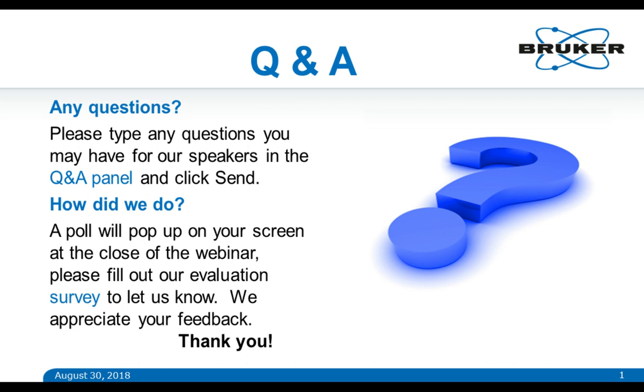So I start questions for the lady first. Elaine, I have a question now. What is the balance between untargeted and targeted analysis in your laboratory? So when we started out, it was 100% untargeted analysis, and personally as a scientist I would always prefer untargeted analysis to start with, because it allows you to do true exploration and find molecules or biomarkers that you don't know about, so it gives you the exploratory capacity.